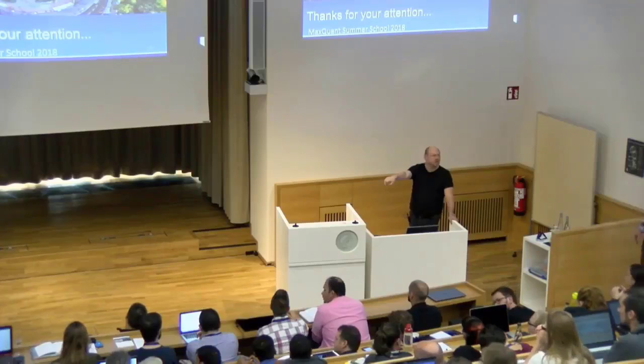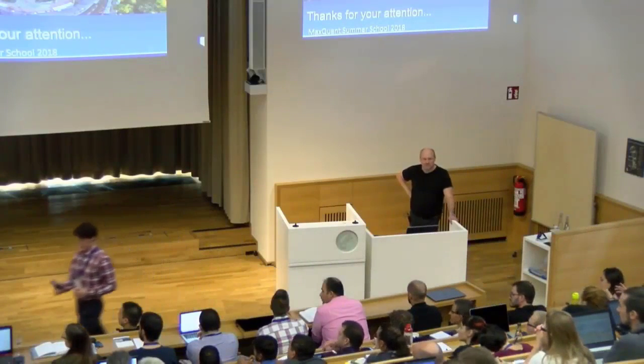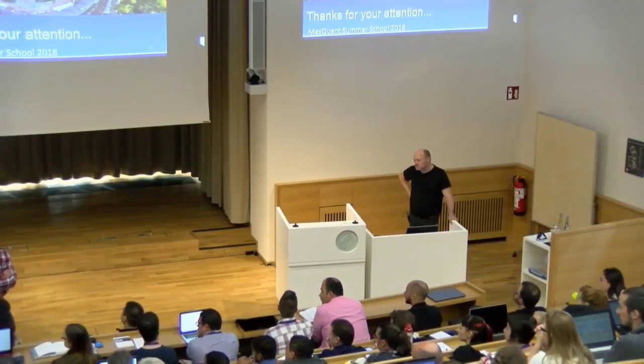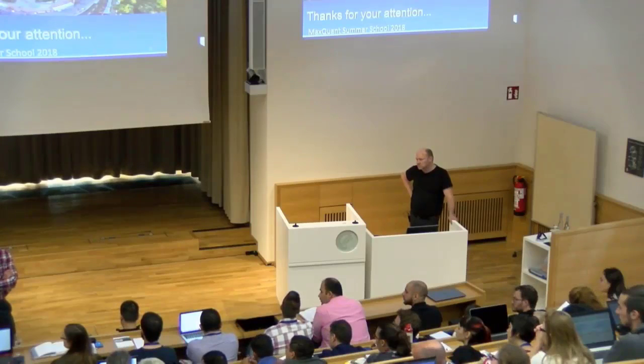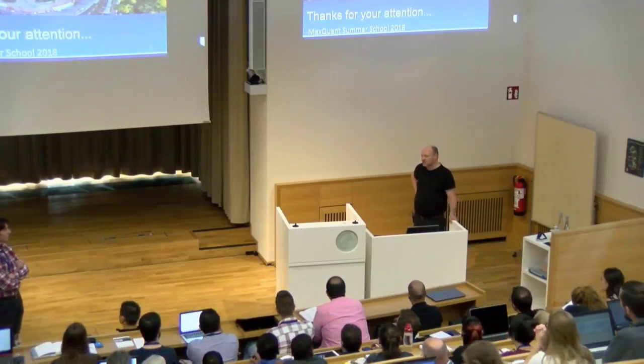There's one in front here. I'm just wondering how, from a technical point of view, do you combine different kinds of labelings together? What I mean is, for example, if you have, let's say, a SILAC sample that you also then want to multiplex by TMT, how would MaxQuant manage this? Because not at all. So that we cannot do, no.